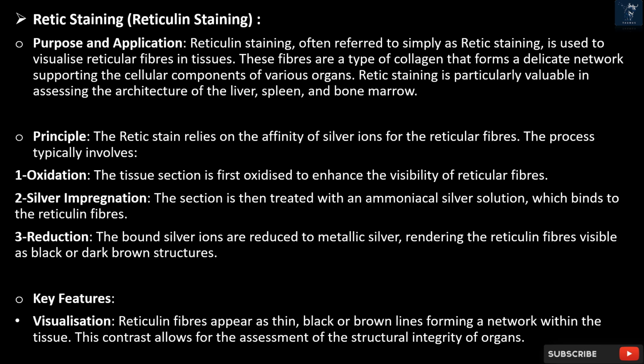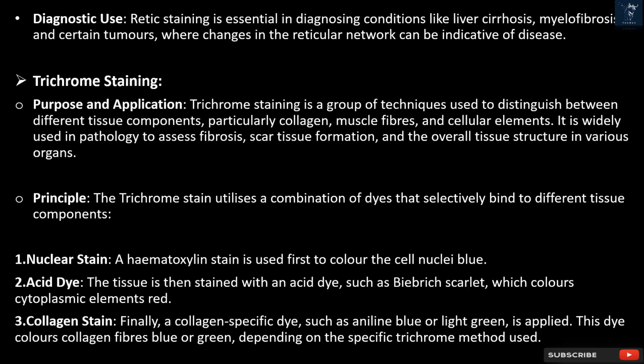This contrast allows for the assessment of the structural integrity of organs. Diagnostic use. Retic staining is essential in diagnosing conditions like liver cirrhosis, myelofibrosis, and certain tumors, where changes in the reticular network can be indicative of disease. Trichrome staining. Purpose and application.